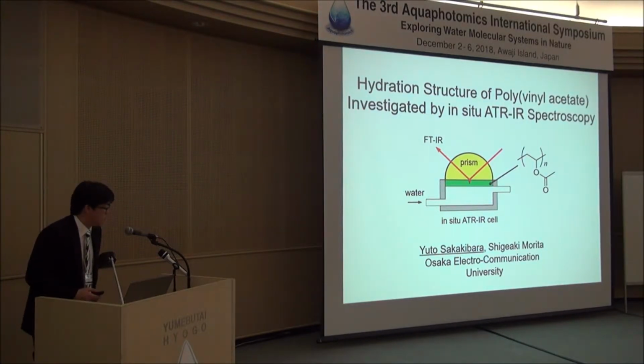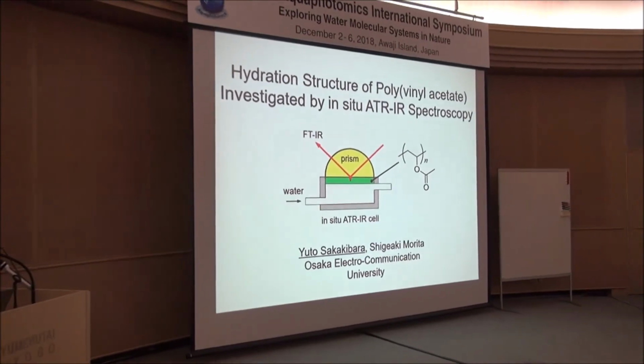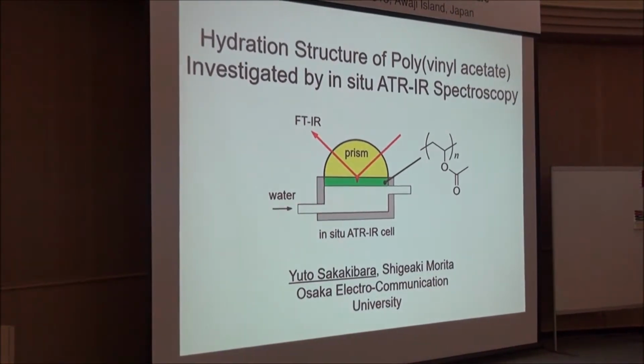I'm Yuto Sakakibara from Osaka Electro-Communication University. I'm going to talk about the hydration structure of polyvinyl acetate investigated by in situ ATR-IR spectroscopy. It has been reported that water molecules play important roles in medical polymers at the biointerfaces.